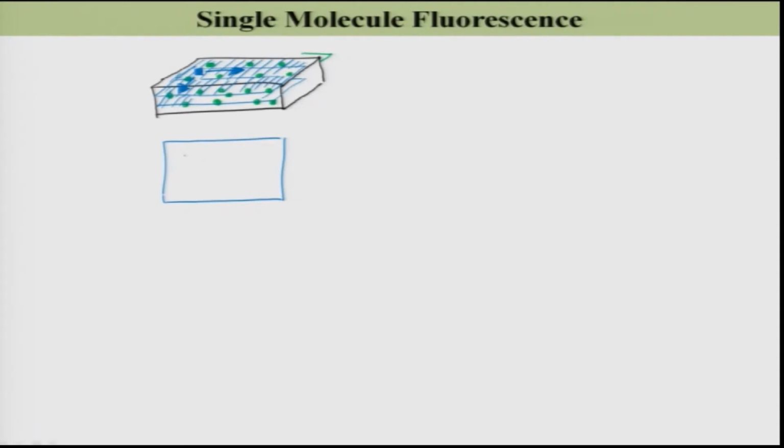obviously we are going to see that one fluorophore is present over here, another is over here, another is present over here. It is random, I do not know, I am just drawing it. Probably you will see such kind of image, one is present over here.